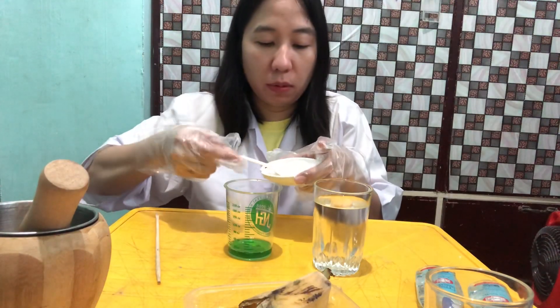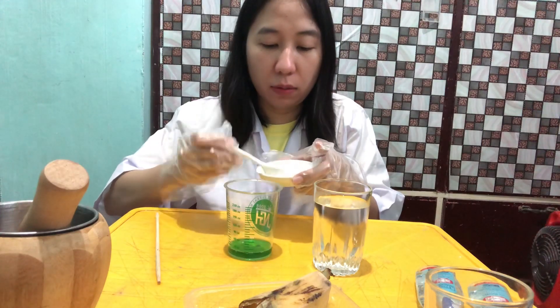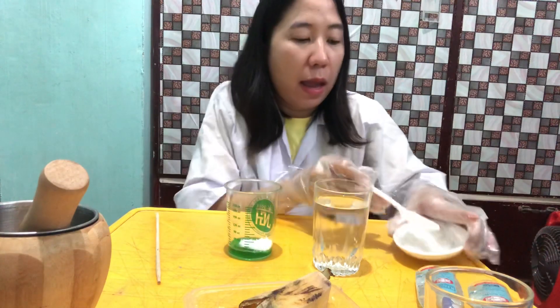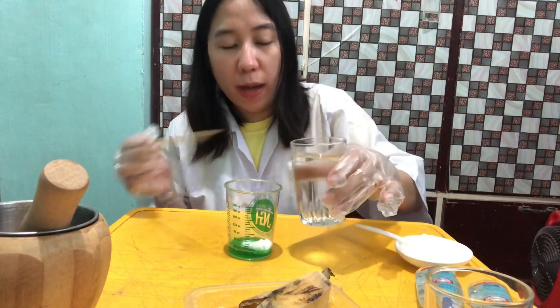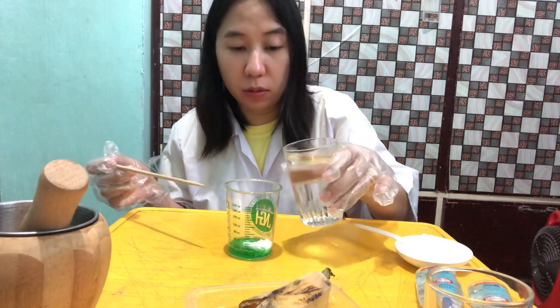Then let's put just maybe a spoon of salt — I'm using rock salt here. Then we're going to add water. You have to pour the water gently because we don't want bubbles to form as we mix our buffer solution.